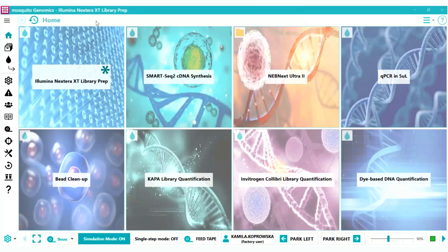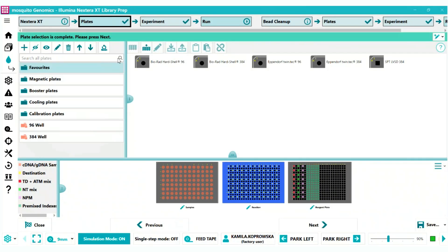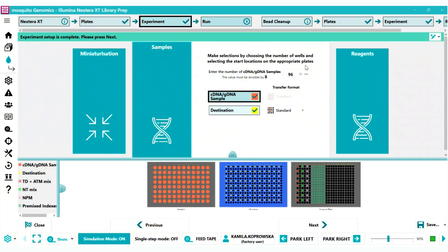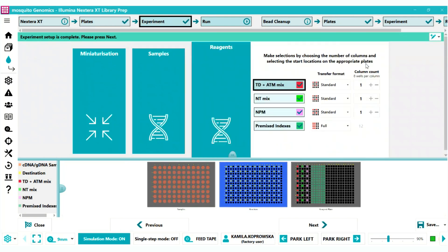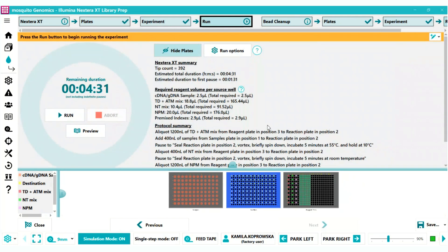The wizard-based experiment guides you through the process step by step, but you still have full flexibility to run your experiment to match your unique needs. You have the ability to change the plates you are using, change the miniaturization level, specify the number of samples you want to process, and specify where particular reagents will be allocated from. On the final page you can see the summary before running the experiment — including the time required to complete it, number of tips, reagent in the source wells, and a description of the steps executed on the instrument.